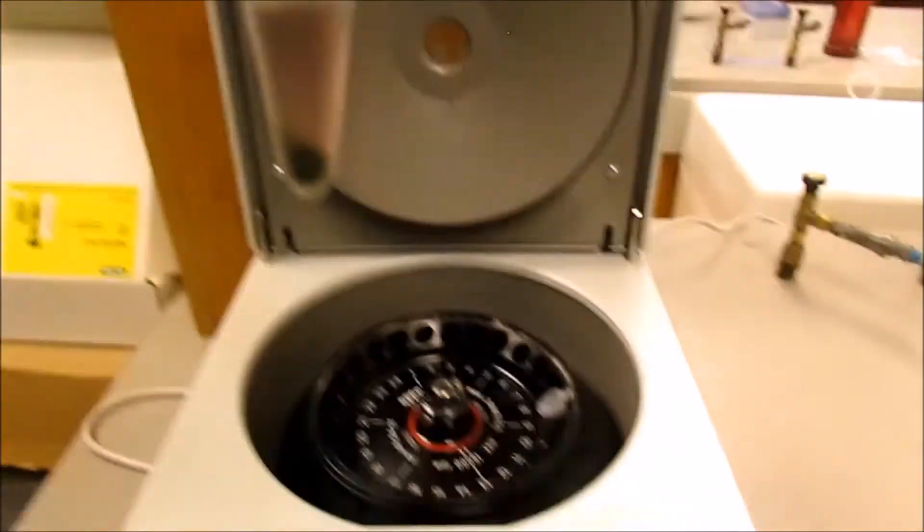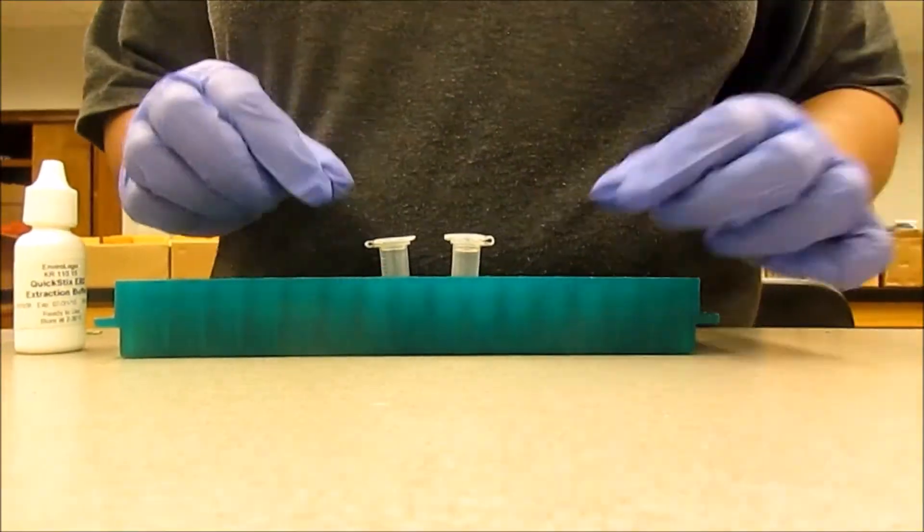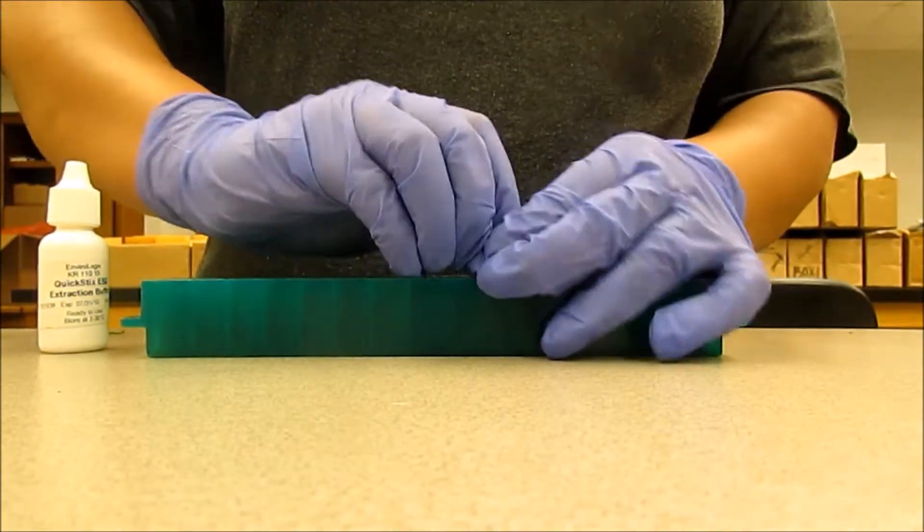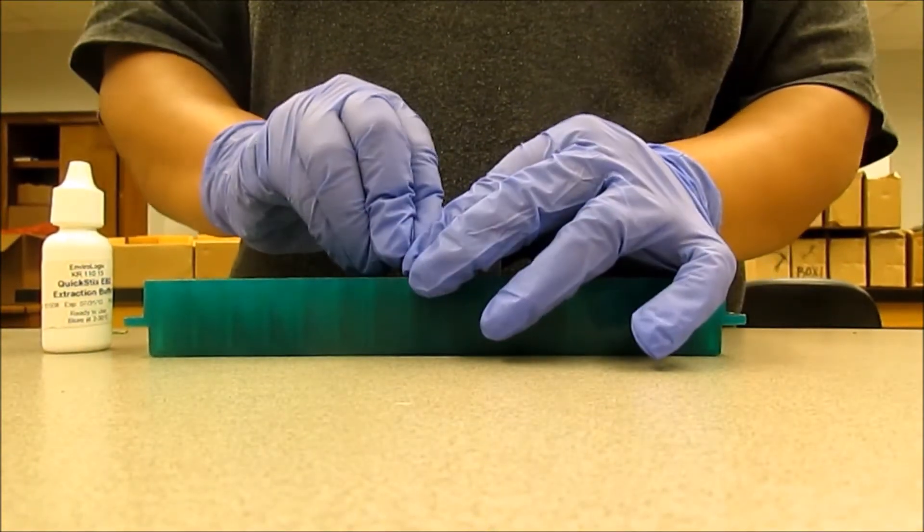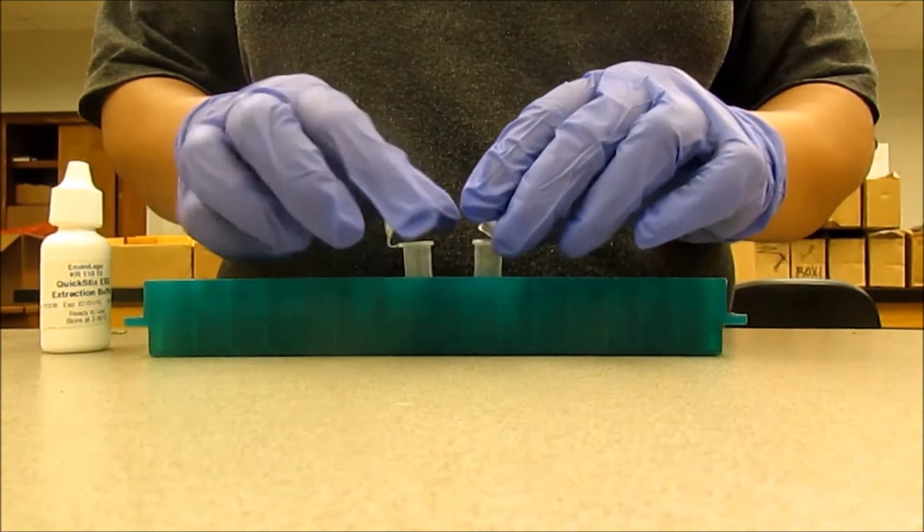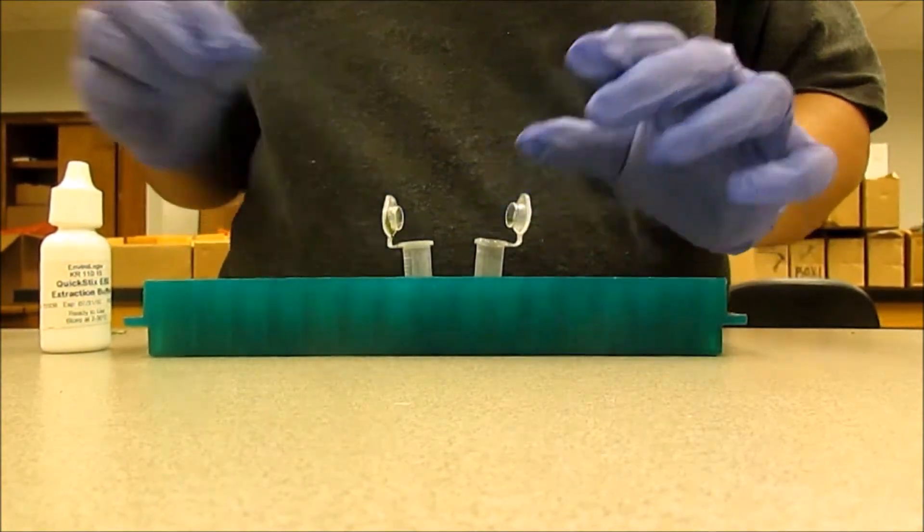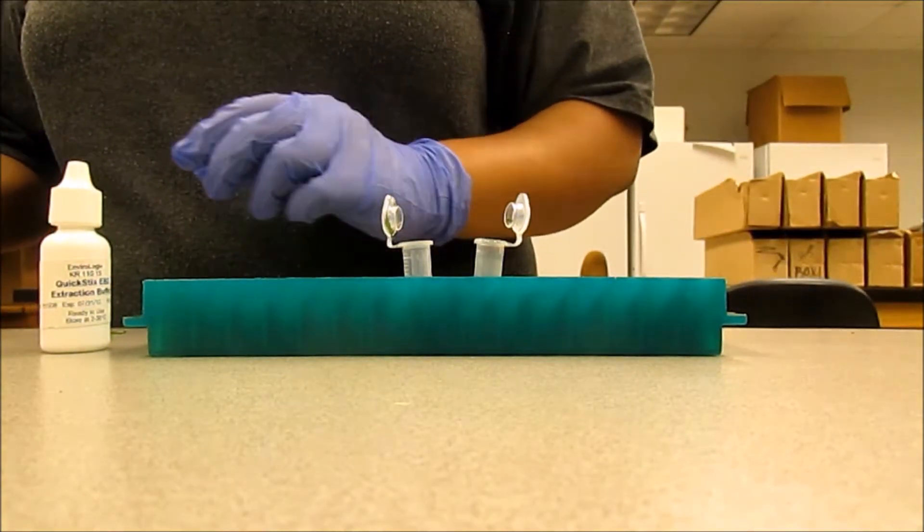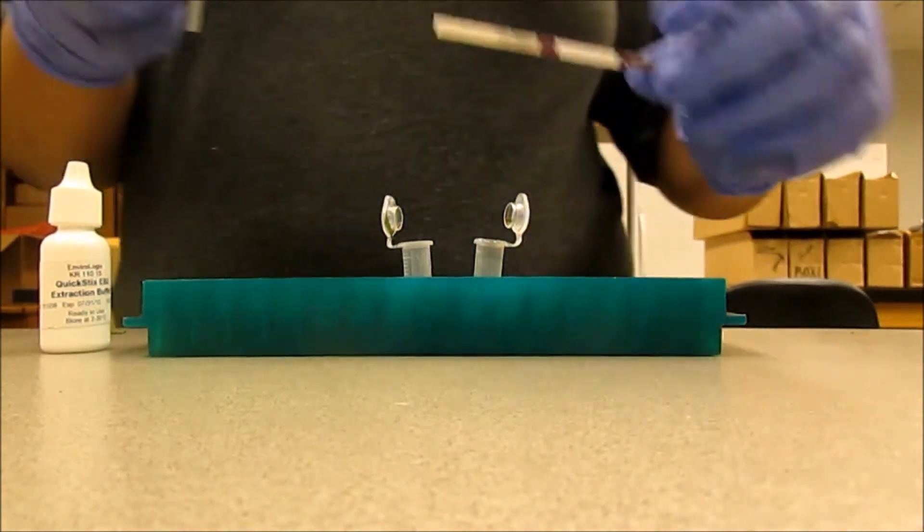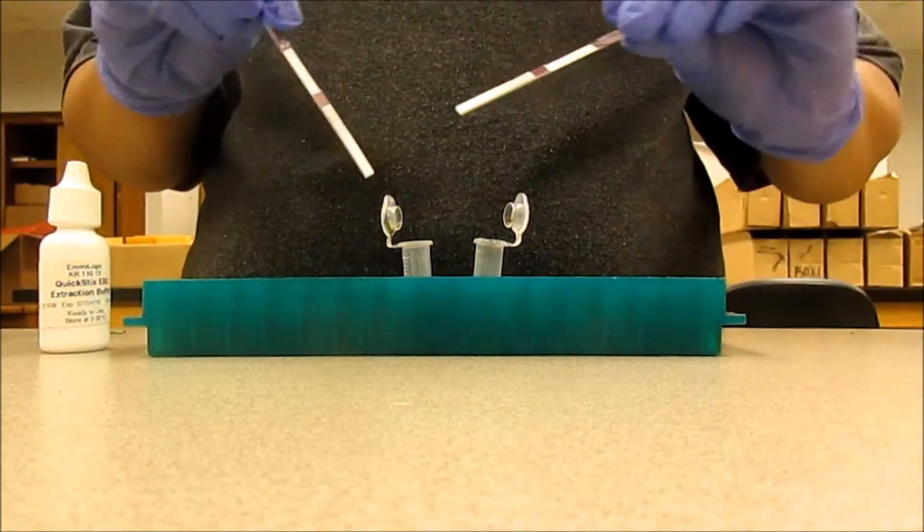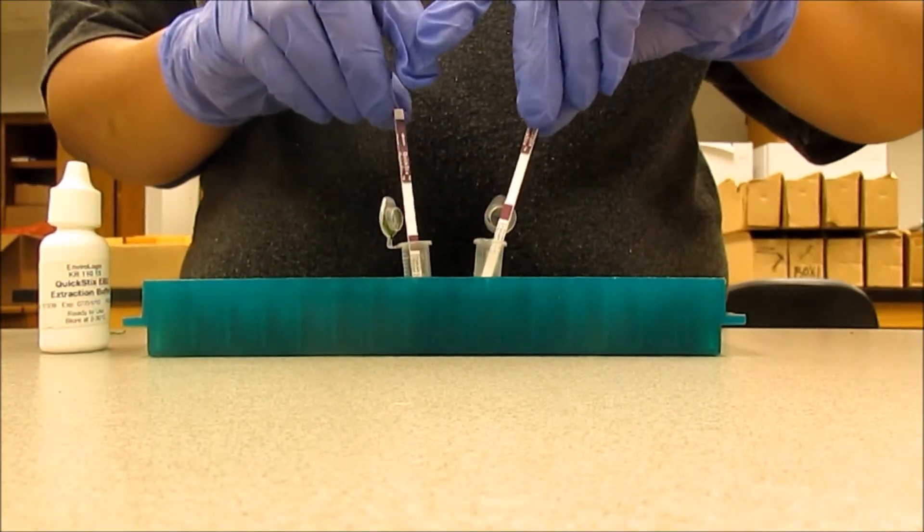After centrifuging, we can see that the debris has settled down nicely. Now we open our tubes. The last thing to do is to just place the testing strips into the samples.